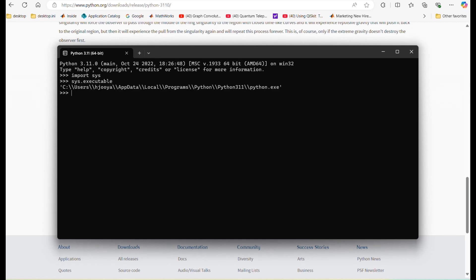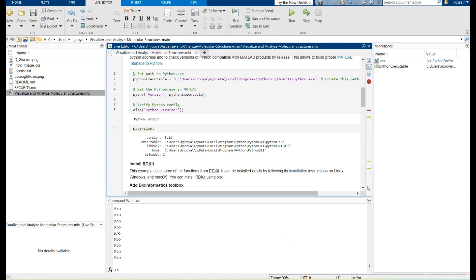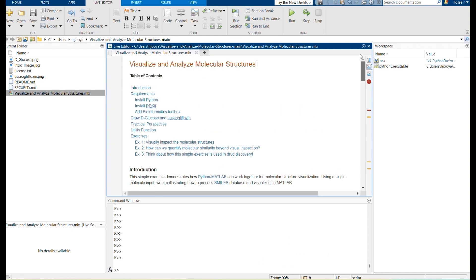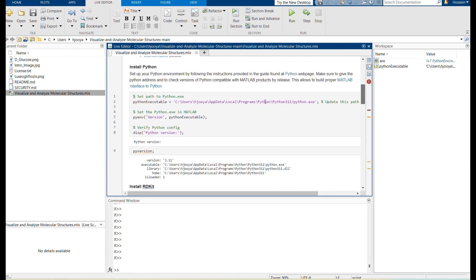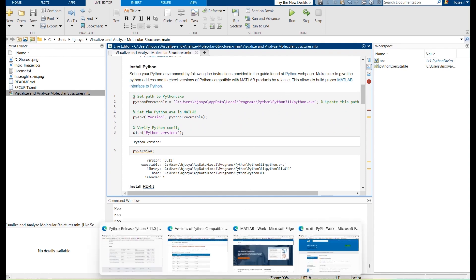Copy this path as you will need it in the MATLAB code that you are going to use later. This enables MATLAB to interface with Python, allowing us to call Python functions and utilize Python libraries directly from within MATLAB.